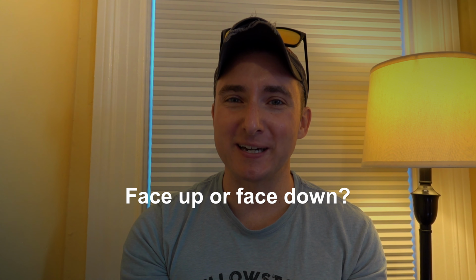Okay, so the second technique for how you open and close tubes correctly or not has to do with screw cap tubes, the kinds of tubes that many of your samples will come in if they've been shipped, or little reagent tubes. And I listen to people talking all the time about whether or not it's appropriate to put the lid face up or face down on the bench, whether you should have a paper towel there to put the lid on or not. And people who have all of the experience they need to succeed will appreciate that there's a third choice. It's not whether you put the lid face up or face down, it's whether or not you put the lid down at all.